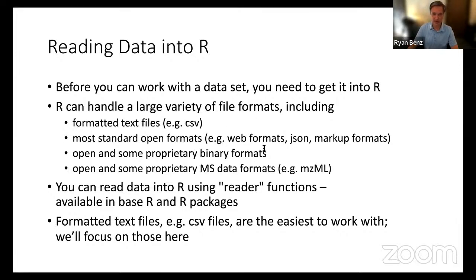So it can read web formats, JSON files, if you've done any web development, markup formats. R can read all these kinds of things. It can read some binary format files that maybe aren't open. It can read MS data files. So for example, mzML is a common open standard for mass spec data. R has packages to read those. So this is all a possibility to do in R.